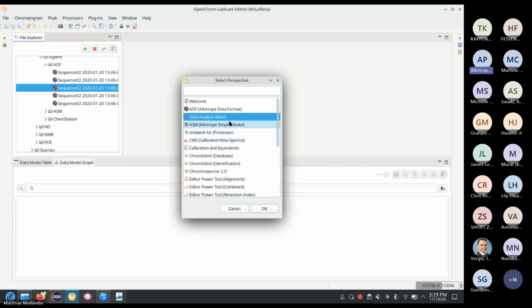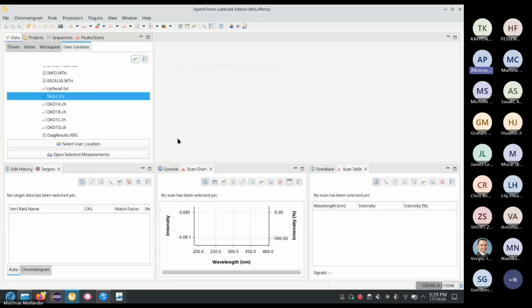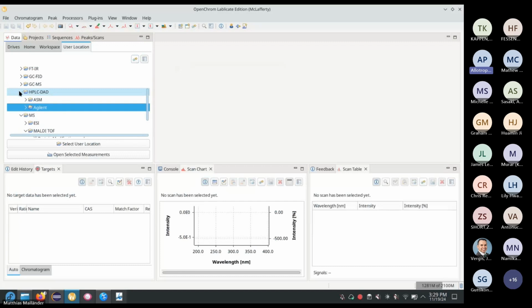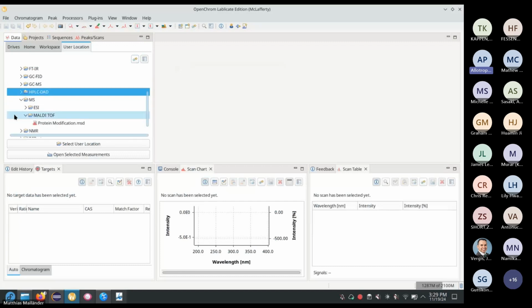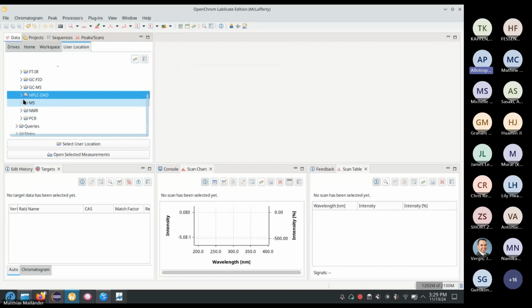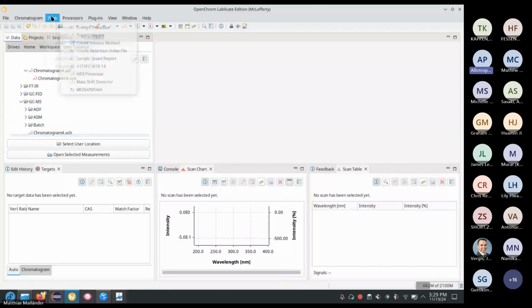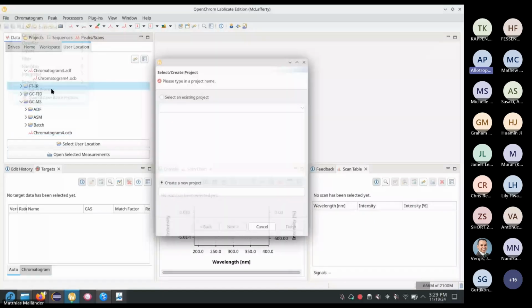So yeah, you might say, I don't have just one chromatogram. I have a lot, and this seems a bit tedious. Also, this right-click menu is probably a little large. So yeah, what do we do? Well, let's batch process this. Let's go here. We have a wizard for that.